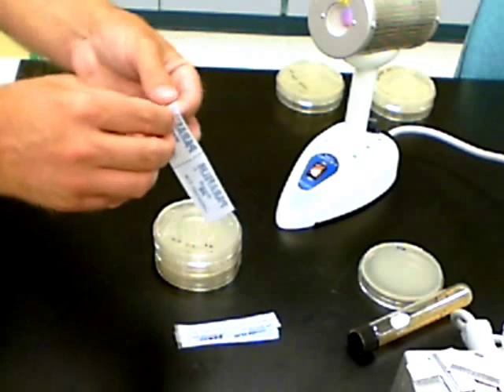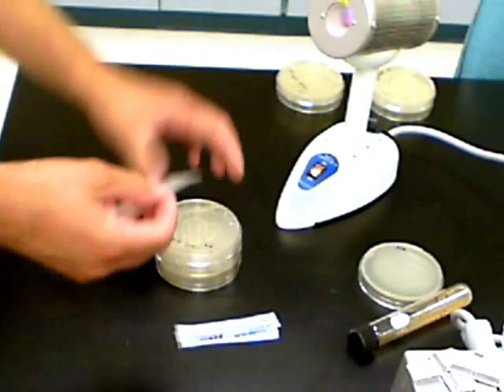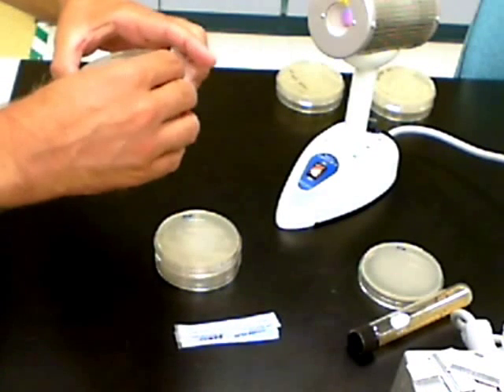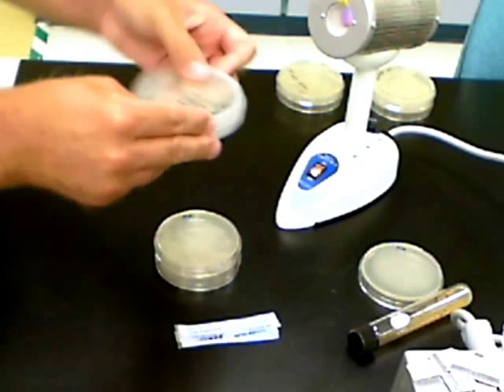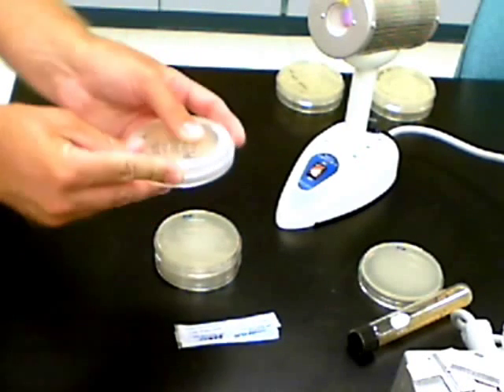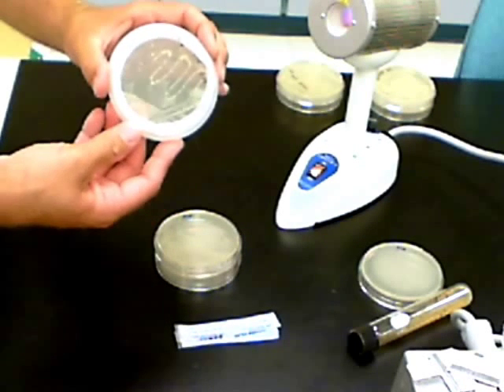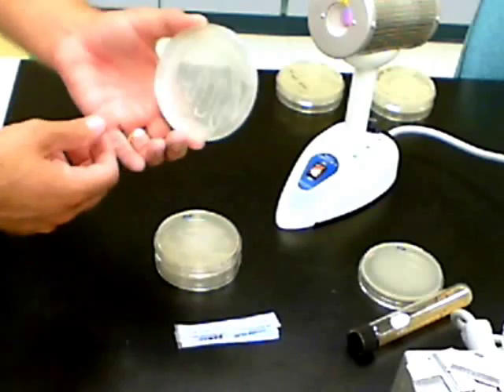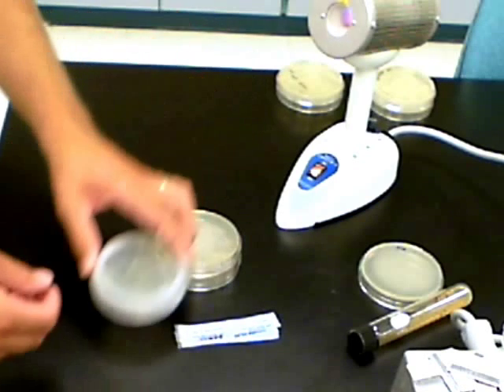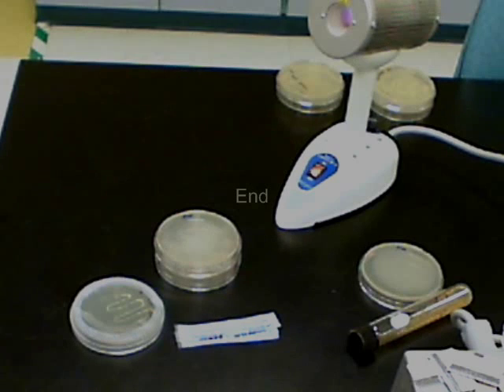When you're finished, you'll want to take a piece of parafilm and wrap the edges of the agar plates to keep them from separating while you're culturing them in an incubation chamber, a cabinet, or some other safe place. Wrap the parafilm around and make sure it's secure. That will allow the plates to have air exchange for the bacteria to grow and carry on respiration, but keep the two halves of the plate together.